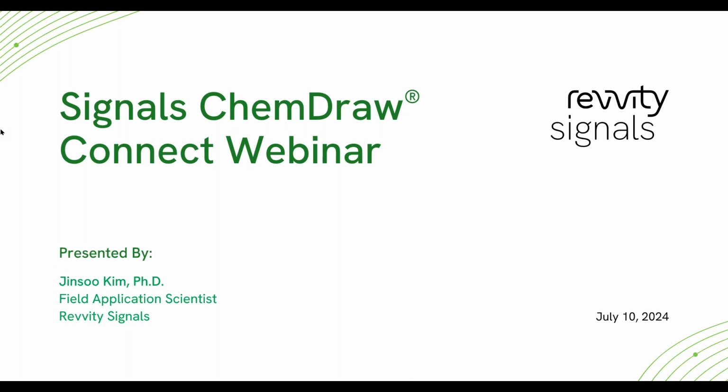Our topics today will include how to quickly and efficiently generate structures and drawings in ChemDraw by leveraging a variety of different supported formats within the software. Also, how to streamline your research using integrated add-ins in ChemDraw, exploring things like the chemistry literature and patent databases, finding existing substances and associated properties, even finding hazard information for substances you may be using in the laboratory.